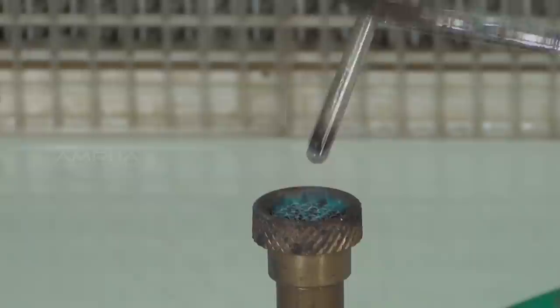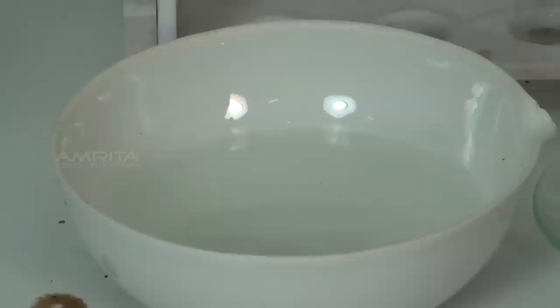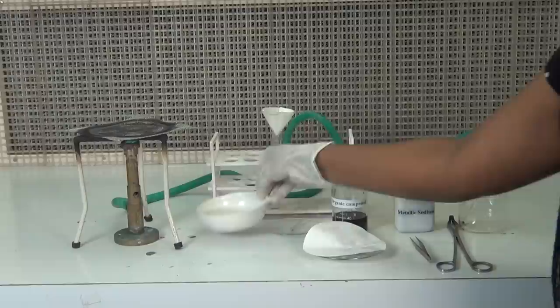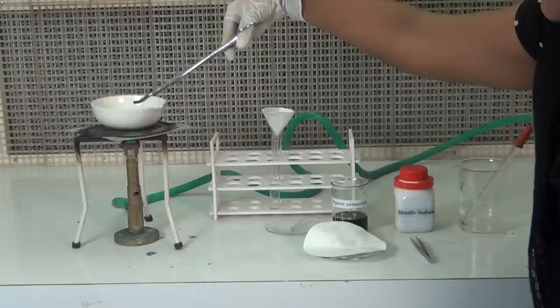To this, add a little of the organic compound using the dropper. Heat it slowly to start with, so that the compound reacts with the sodium metal. Next, heat the tube strongly till it becomes red hot. Plunge the red hot tube into the china dish containing a small amount of distilled water. Heat the contents of the china dish over the Bunsen burner until the volume of the solution is reduced to one-third of its initial volume.